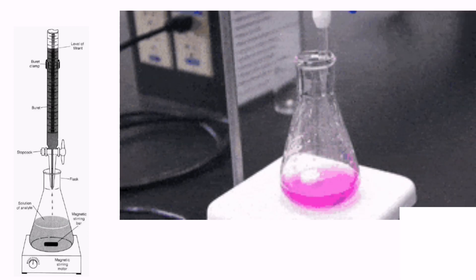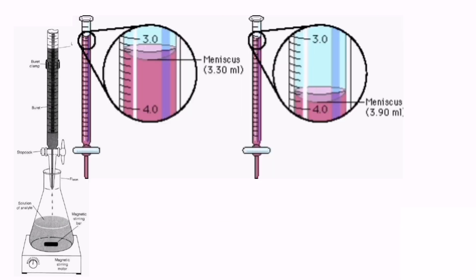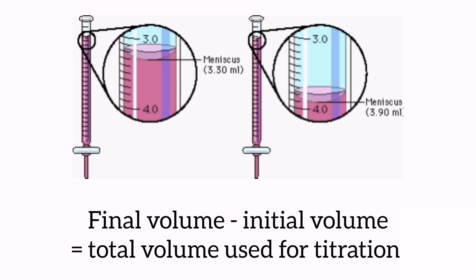Titration proceeds till the solution color turns pink. Note down the volume of potassium hydroxide used during titration by subtracting the initial volume of the burette from the final volume of the burette after the experiment.